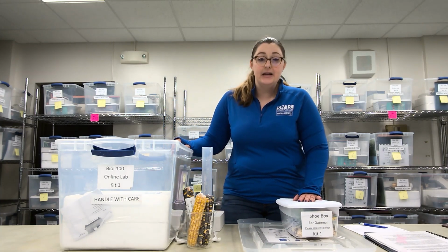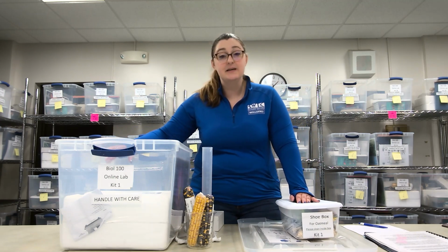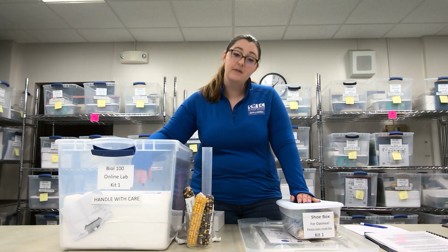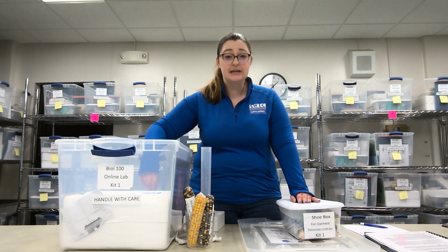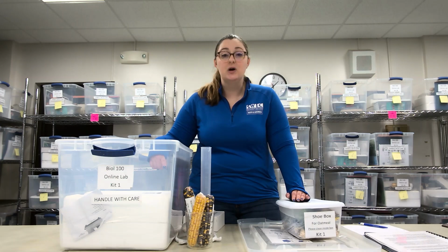I have left an item in the kit itself, and that is this big styrofoam box. That is going to hold your microscope and the power cord to your microscope. You can leave that in here. They should all already be checked. They are taped together.